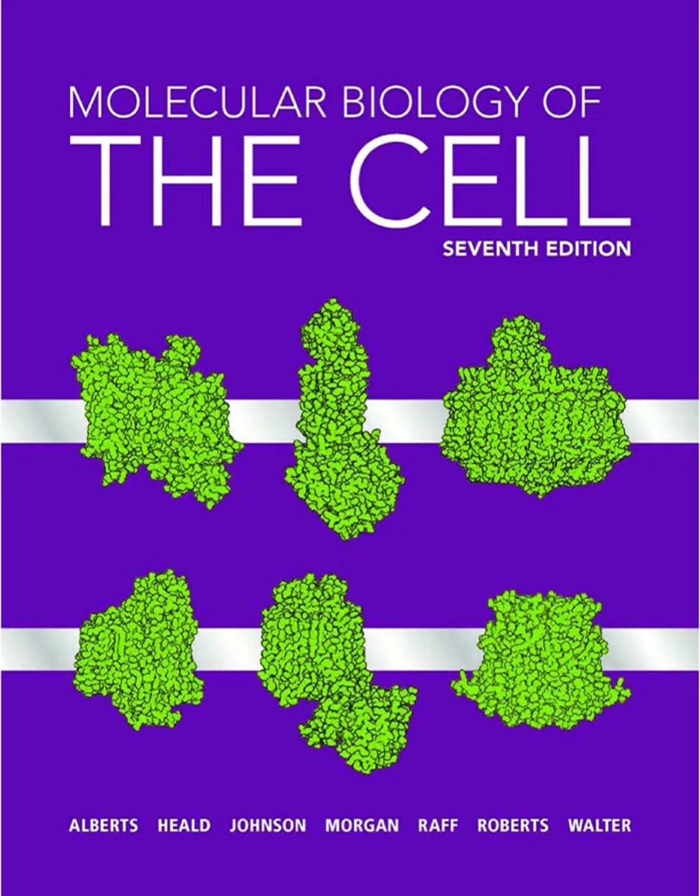But there are big trade-offs you mentioned. Major trade-offs. Generally, you're looking at fixed, dead cells because the sample has to be in a vacuum and withstand an electron beam. Specimen preparation is much more complex and artifact-prone. You gain resolution, but potentially lose some lifelike context or dynamics.